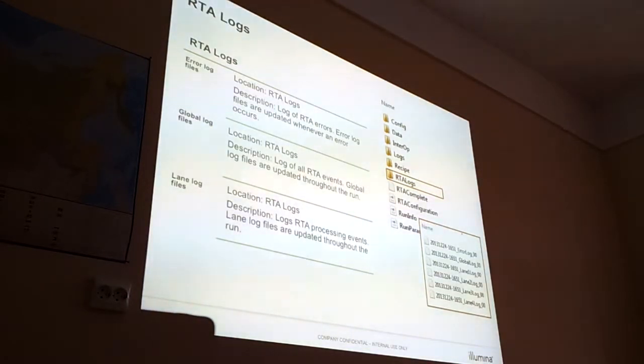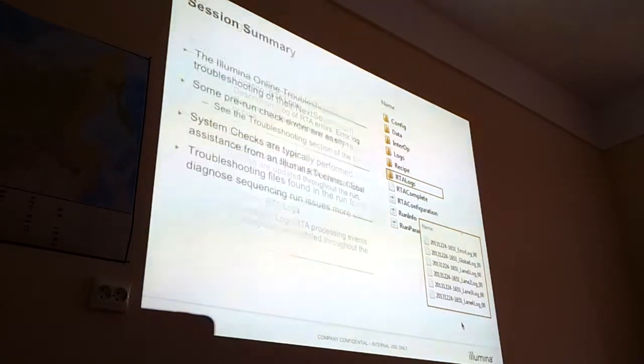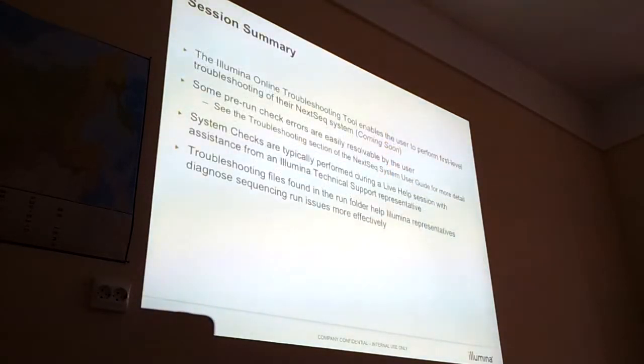So there are different log files. Actually, you don't. This is for tech support, yeah. So you don't really. Yeah, we have an online troubleshooting tool. Now it's already ready for MiSeq. For NextSeq, it's coming.